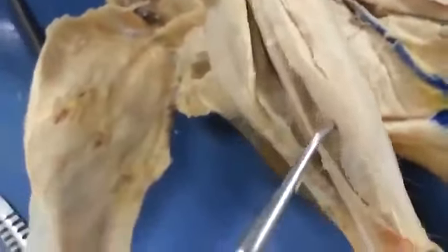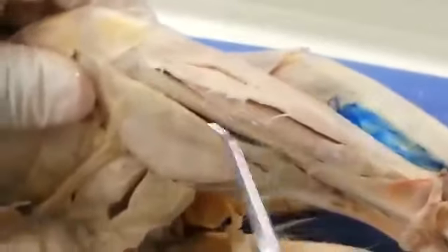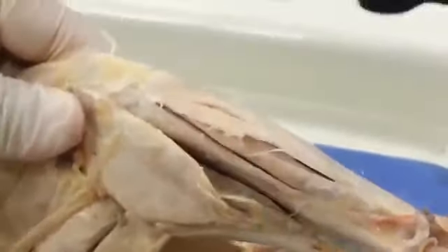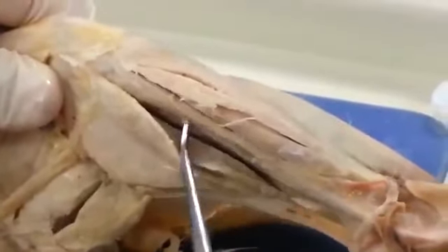Let's see, where's the good dissection here? So initially you're going to see the tibialis anterior, which is this muscle here. The tibialis anterior is going to dorsiflex the foot. Lateral to that, you're going to have the extensor digitorum right there, which is going to extend the digits of the feet. The fibularis longus.